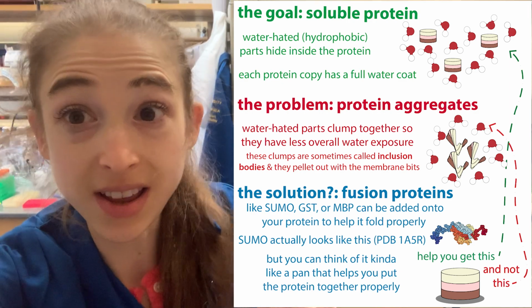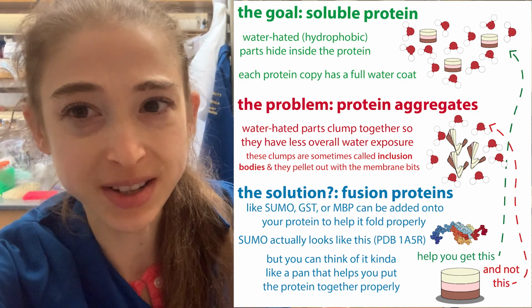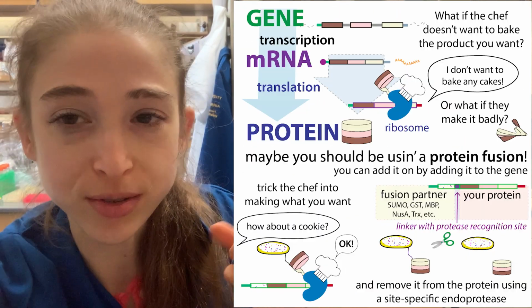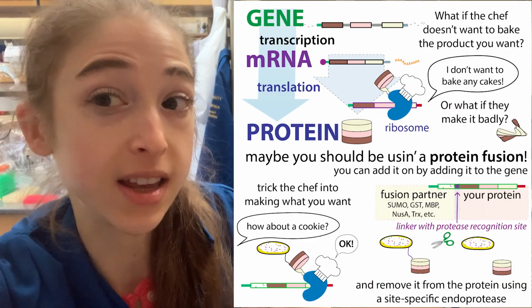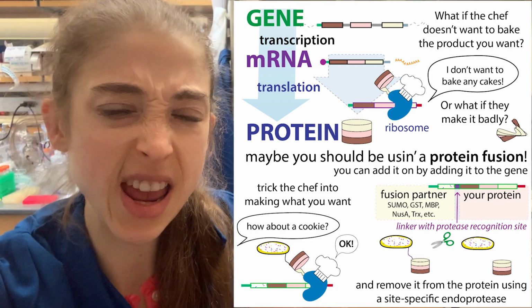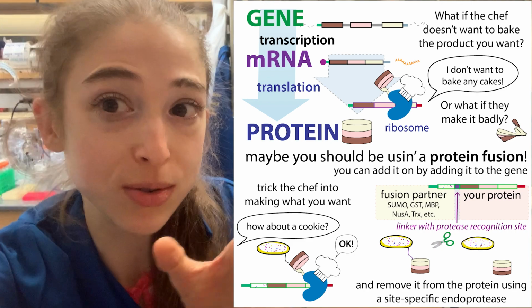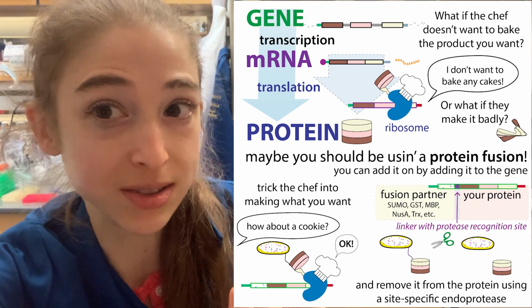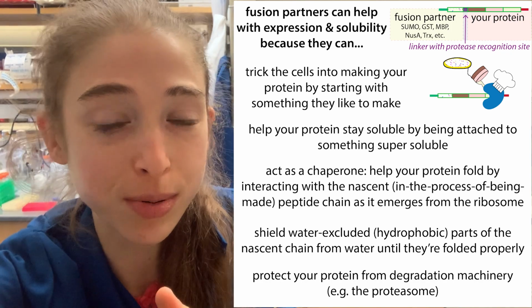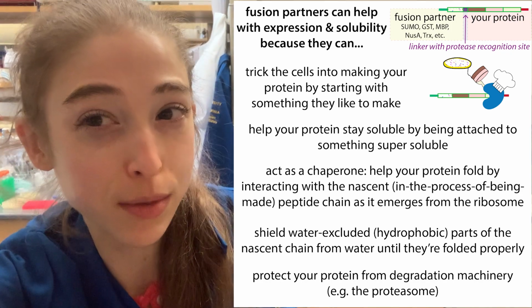Trying to get cells to make a lot of soluble protein and they're refusing? Perhaps you should be using a fusion. Fusion partners or fusion proteins are these little proteins, things like SUMO and GST and MBP, NusA, TRX, that we can stick onto the ends of a protein that we want cells to make for us. And this can kind of trick the cells into making our protein because they really like making that other protein.